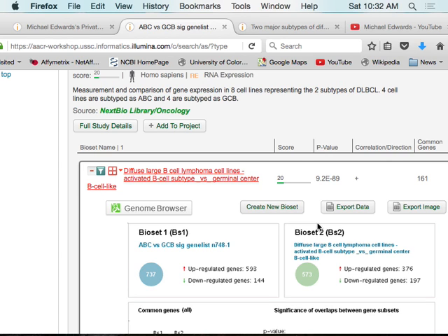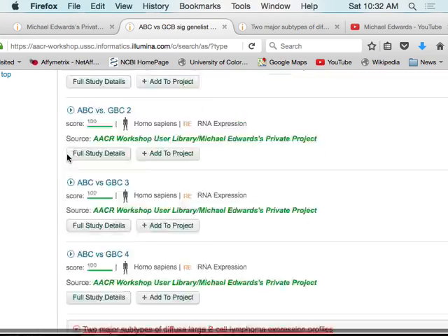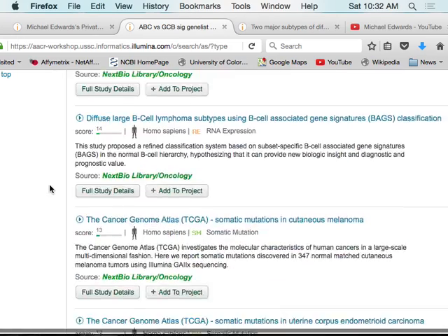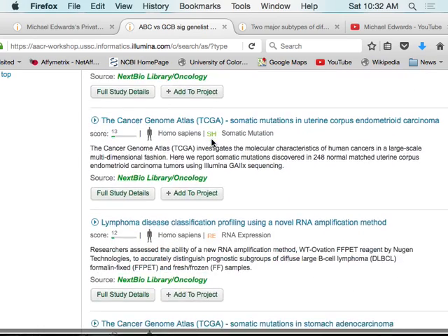I go through these studies and there is absolute garbage out there. And people publish in really big journals. Kills me. Okay, so again, this will give you an idea. You can go down here and obviously it's going to pull up a lot of things that are associated with cancer, and we would expect that, right? Even mutation. Well, actually, don't look at this, this thing just has all these mutations. But anyway, B-cell lymphoma.